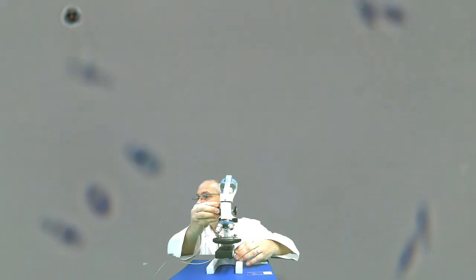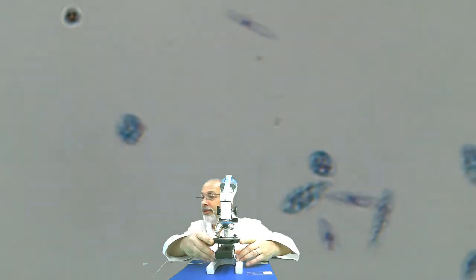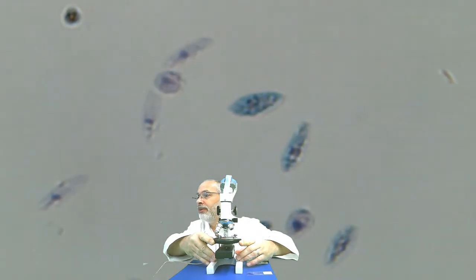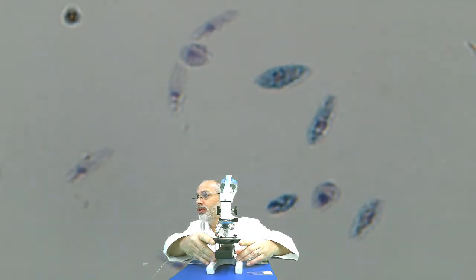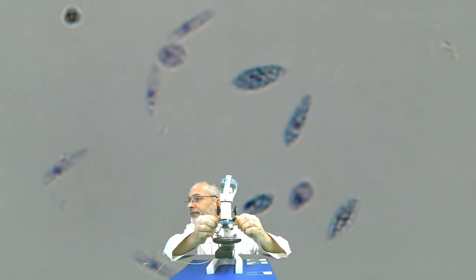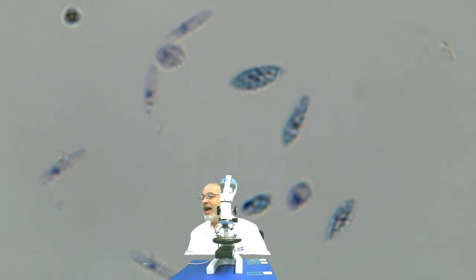There we go. And let me find some individual Euglena. Here we go. Let's focus a little bit better. And so this is 100 times magnification. Take a few moments to illustrate Euglena under 100 times magnification.